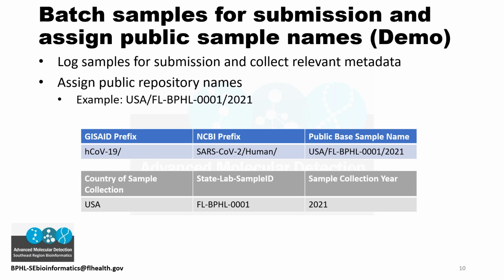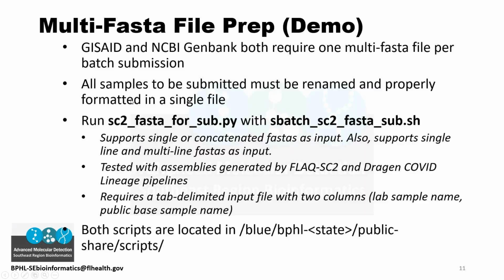So first, I do want to go over why all the samples have to be renamed. As you saw from my examples, I just gave them example names. Usually ours stay with our lab session, whatever it was, through the whole sequencing process, and then after that we have to rename them upon submission.